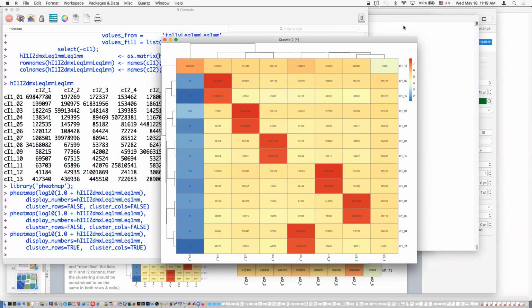Here, of course, the clustering is going to group the two guys that are both sharing the I1. Okay, you can see that the phi-X hops here are very much in one direction. This is blue, which is low. Phi-X hops, which, I say phi, but it's not necessarily phi because it's probably dark.